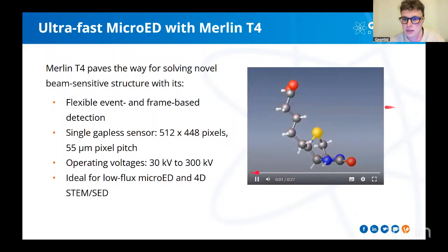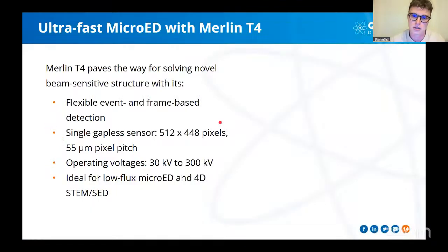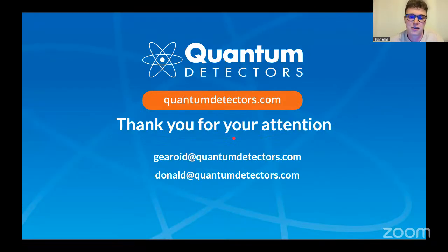This is a video of the structure. I think the R factors are around 20%. I think there's a little bit more work to do with refining it. I was a little bit rusty when trying to work on it. But thank you for your attention.